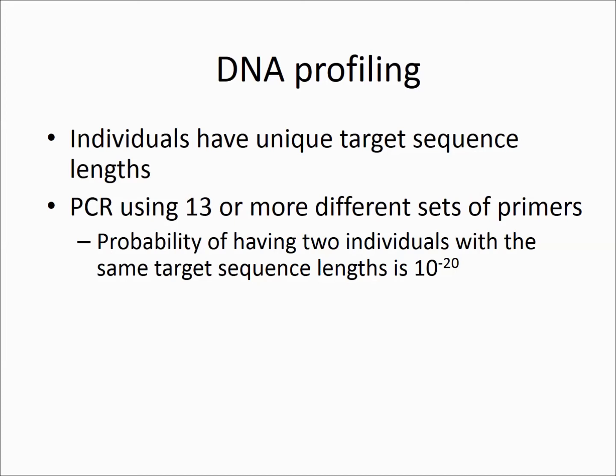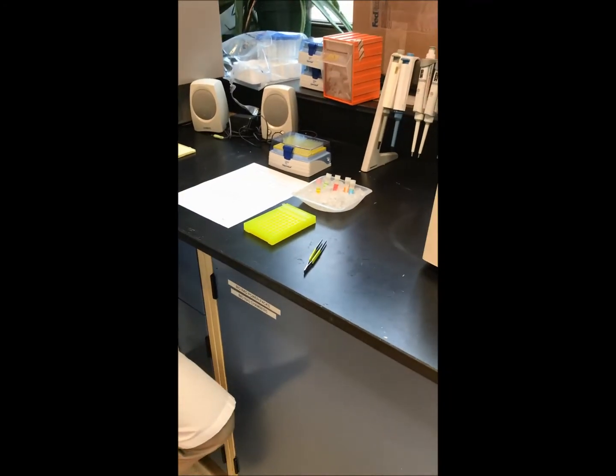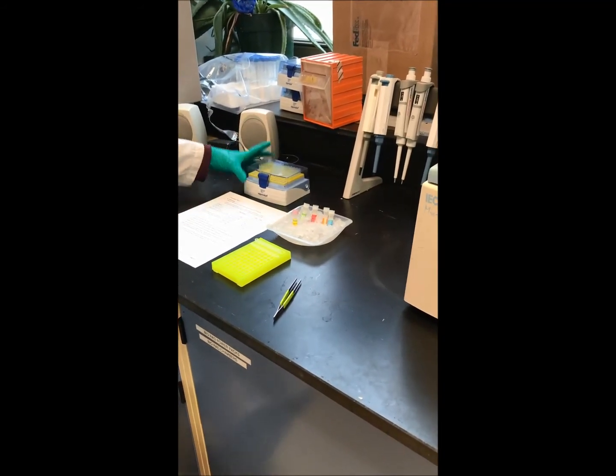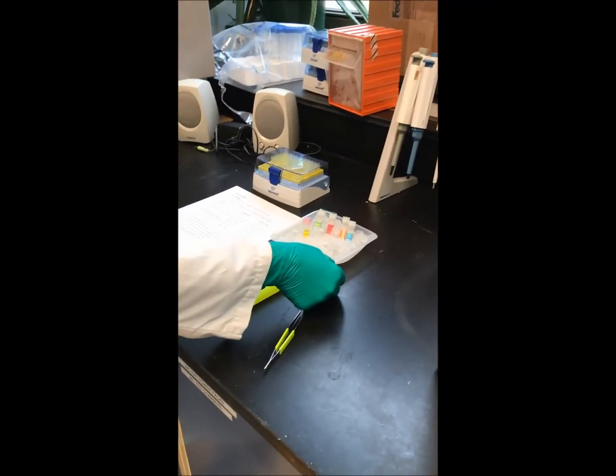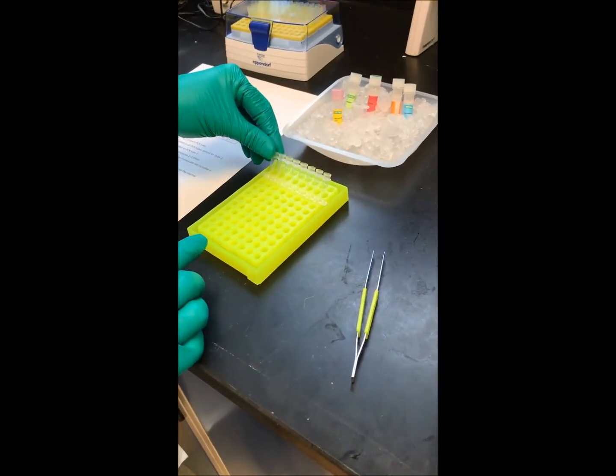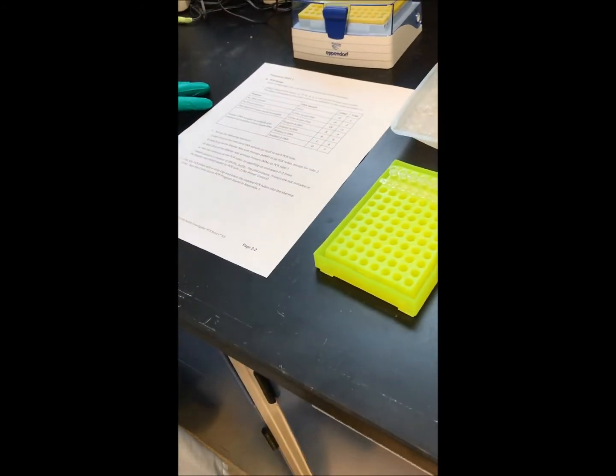Essentially, very, very unlikely. Today I'm all ready, dressed up for performing the PCR technique on the DNA samples that were recovered on the crime scene, as well as from the victim and from various suspects. Okay, this is the laboratory setting, and we're going to perform PCR today. So we have pipette tips, we have pipetters, we have ingredients for PCR, and we have special PCR tubes for carrying out the reaction. And here we have a protocol that tells us the steps and as well the ingredients that are needed for the reaction.